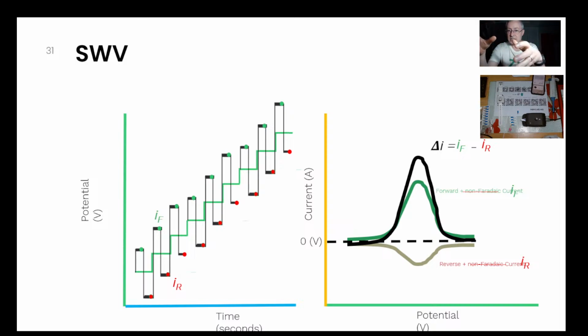And then when we've got that sense of actually we've got an oxidation reduction wave, we're going to do square wave voltammetry, but we'll narrow in on a narrower portion of the potential window, let's say. So it does actually work.